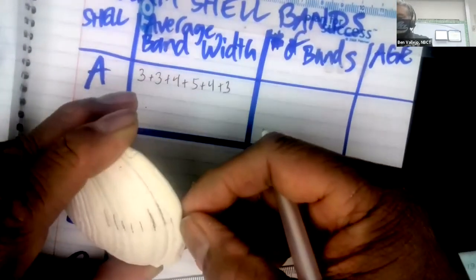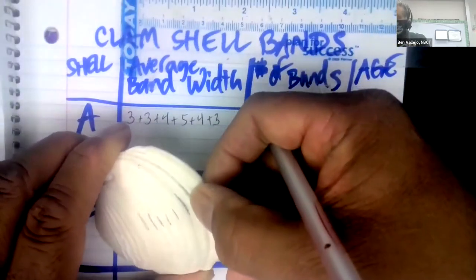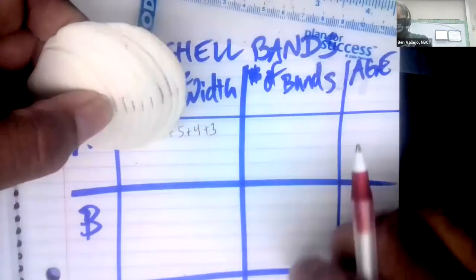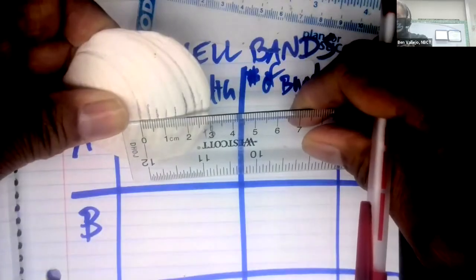Okay, so this one's our 3, this is 3, this is 4. Oh, sorry, I can't see. 4, 5. This one right here is 4. This one is 3. We're going to count a couple more there. That one looks like it's 4 to me.